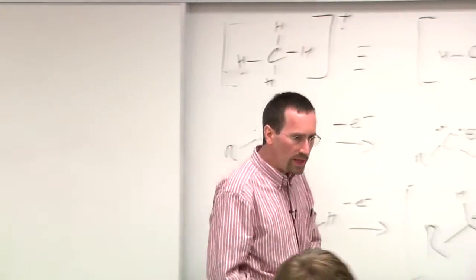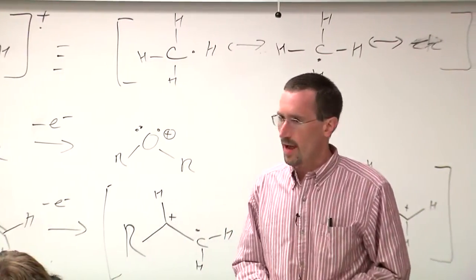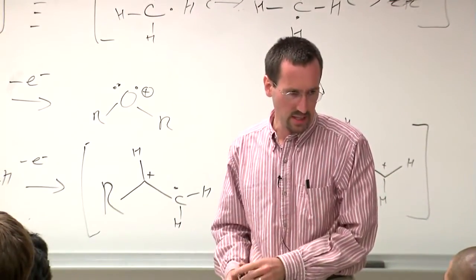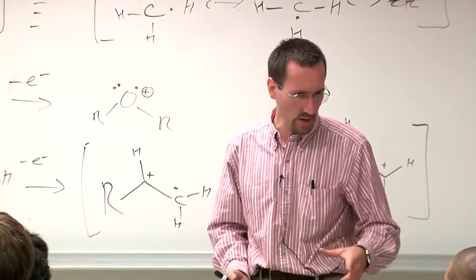Thoughts or questions? About not being able to see a radical? Exactly. So the question was about not being able to see a radical. When we start to talk about fragmentation, you'll see a little bit of this, because at the end of today's class, I'll even show you an ESI mass spectrum where a molecule does break apart.